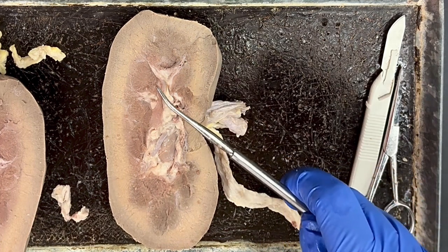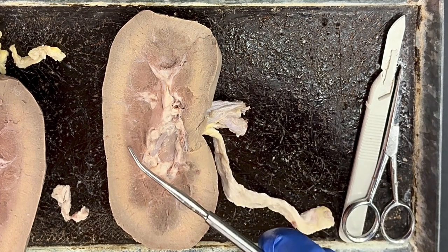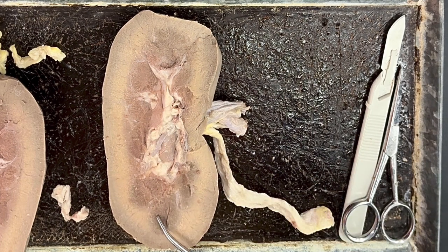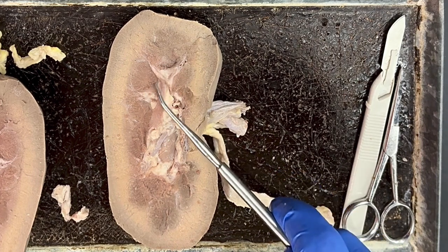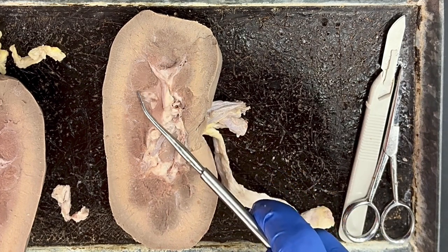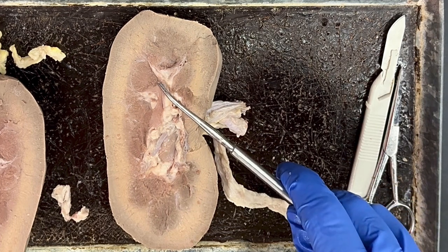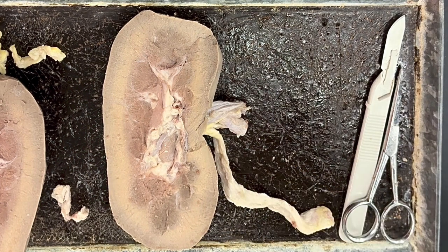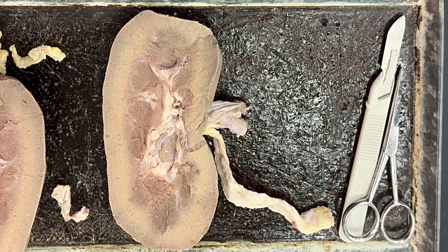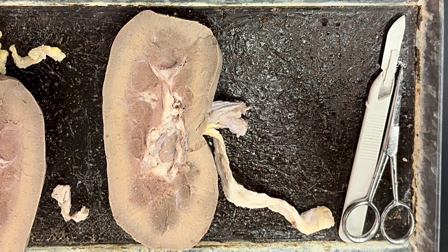The medulla we can identify by these renal pyramids, these triangular shaped structures that we can see when we dissect. This one in particular, we can really see that triangle shape. And then the tip of the renal pyramid is going to be the renal papilla, or renal papillae, which would be the plural term that we would use.